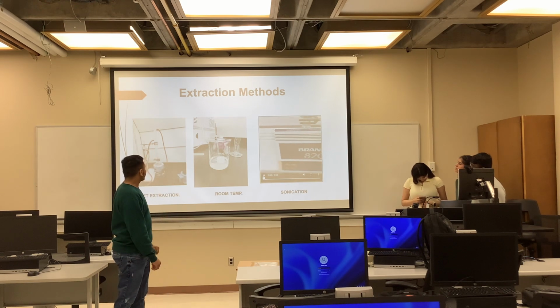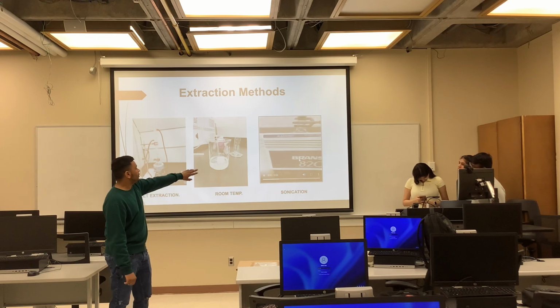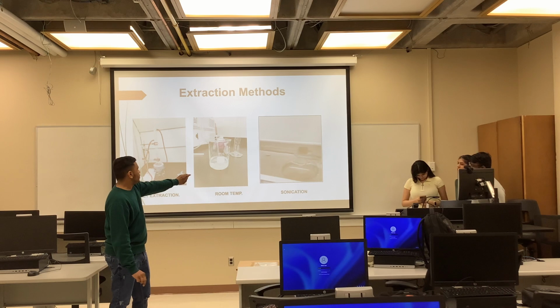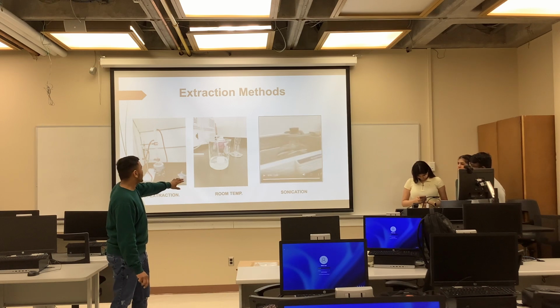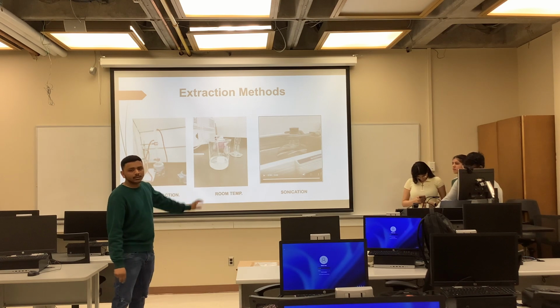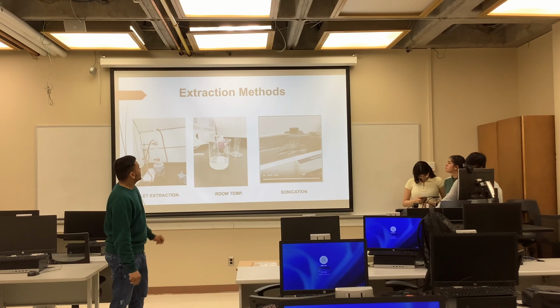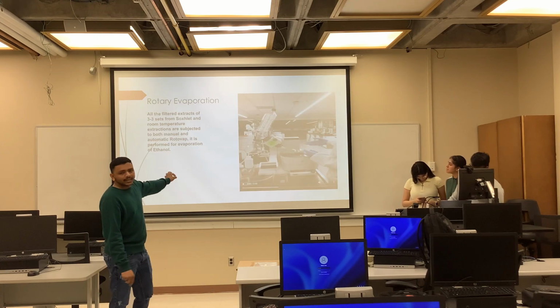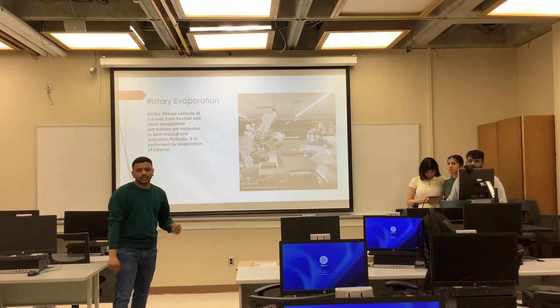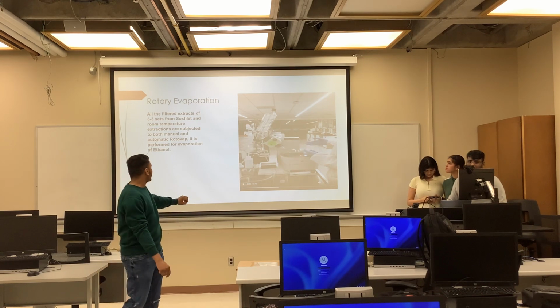Next slide. And here is the video of the sonication. It's almost similar to the room temperature, but it used frequency and heat together to get more yield. And for the next slide, after getting the yields, we decided to do rotary evaporation to get a more purified yield.